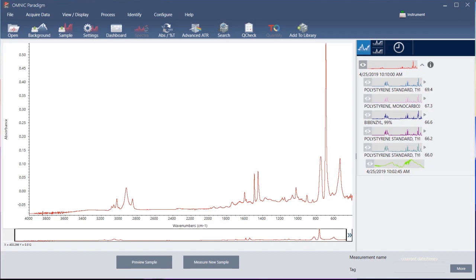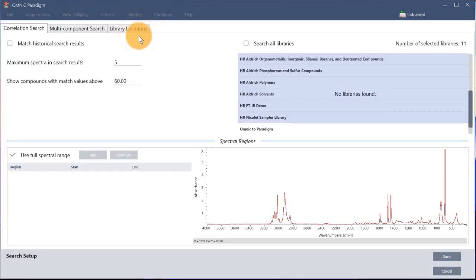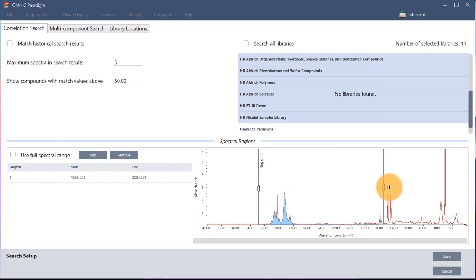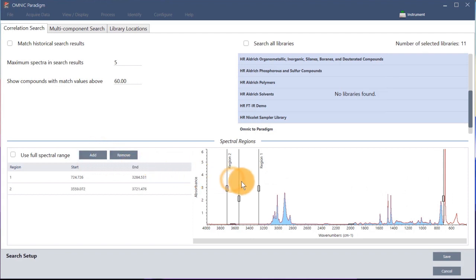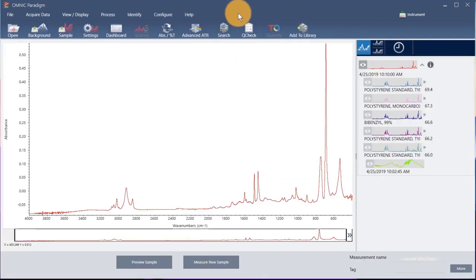To exclude a totally absorbing peak, choose Search Setup in the Identify menu and use the tools to select the regions to search. First, clear this checkbox to enable the region tools. Here, we are positioning the vertical bars to select the region to the left of the off-scale peak, and then adding a region and using the second set of vertical bars to select the region to the right of the unwanted peak. When you are finished selecting the regions, click Save, and then click the Search button on the toolbar to rerun the search.